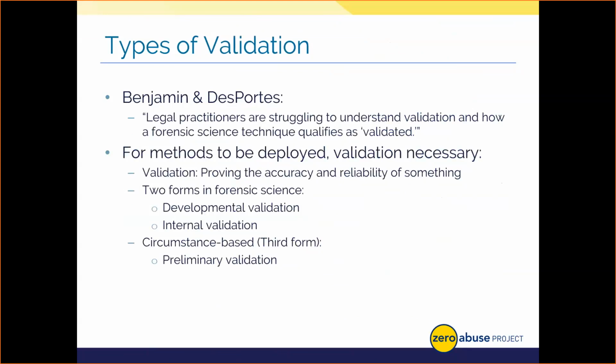Validation, for reference, refers to an individual proving that a given thing, like a piece of equipment or a chemistry or test method, is consistently reliable and able to produce the intended outcome for which it's used. Developmental validation, then, is the acquisition of test data and the determination of conditions and limitations of a newly developed method for analyzing samples. Basically, research and design companies do developmental validation and create the new equipment and methods that we use.